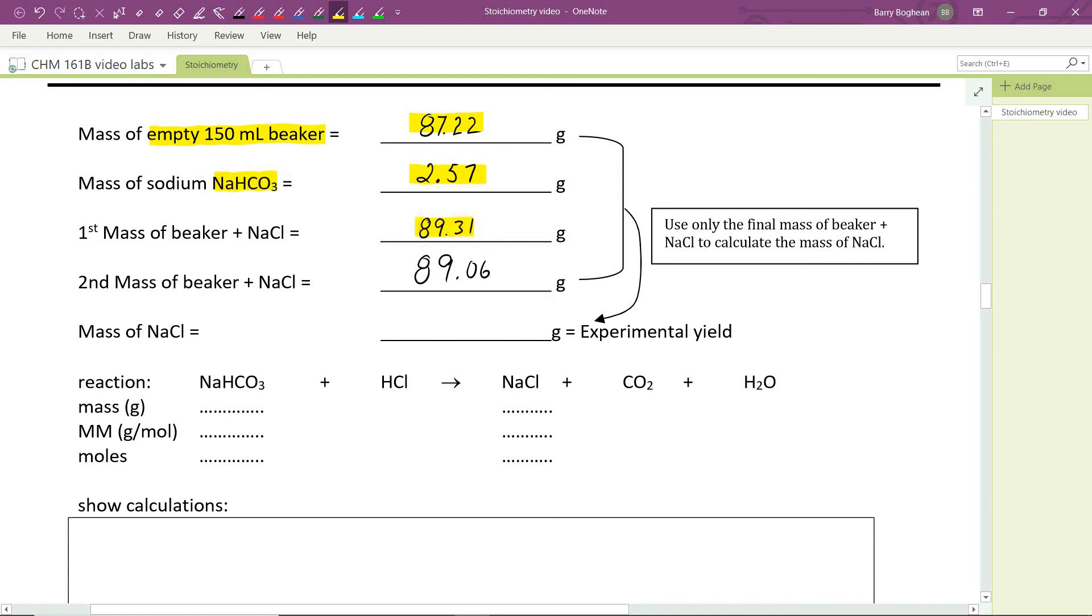89.31, well, that was not our first mass, but it was probably our third mass. It was an intermediate mass, which we're not going to use in our calculation. We used our final mass. Here it says second, but it was actually our fourth. Fourth and final mass, 89.06 grams.